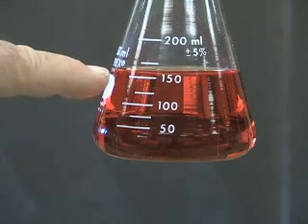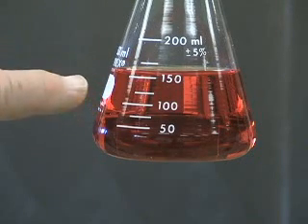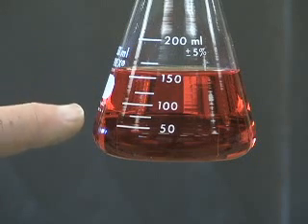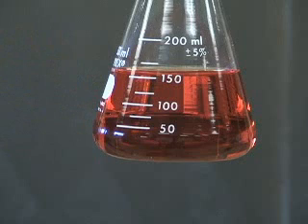So let's try to read the volume of the liquid in this flask. It's not going to be as easy as it was on the burette, where the volume markings were very precise, very close together, and told you the volume to the nearest tenth of a milliliter. You could actually interpolate to the nearest hundredth of a milliliter, of course with some error.